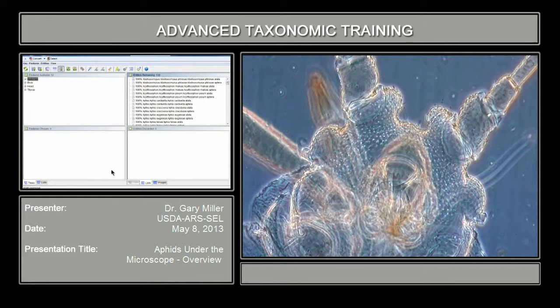You can see the tubercles right there. In this case they're much higher than the frons, which is that center portion of the head. Remember when I said how Aphis gossypii had a smooth head? You can see that here Myzus persicae has a lot of scabrous areas all through it — not only on the dorsum, but on the venter.